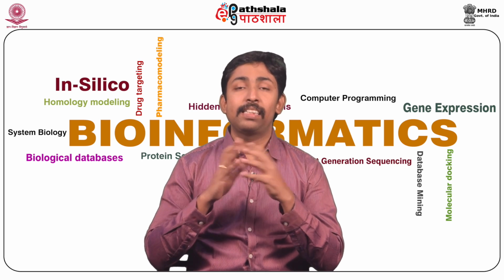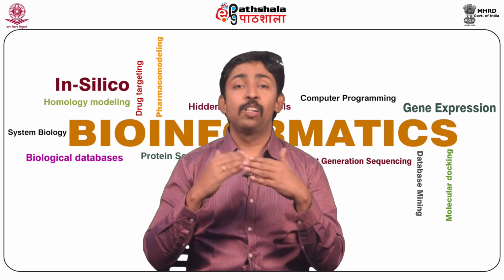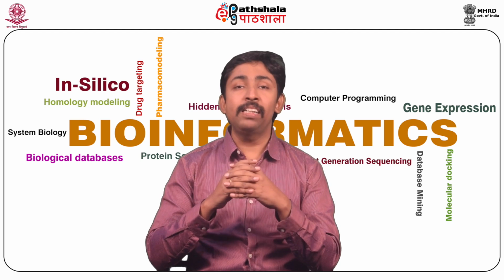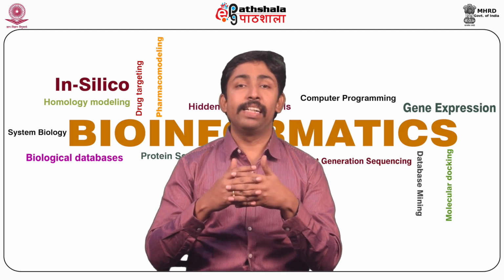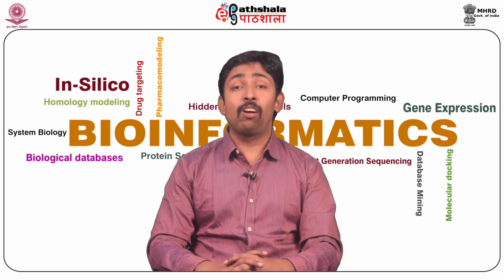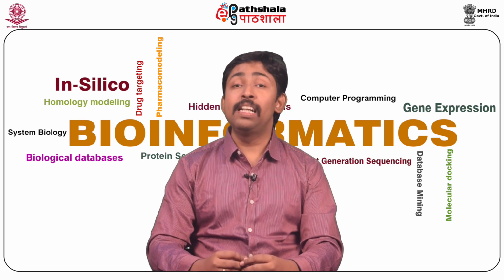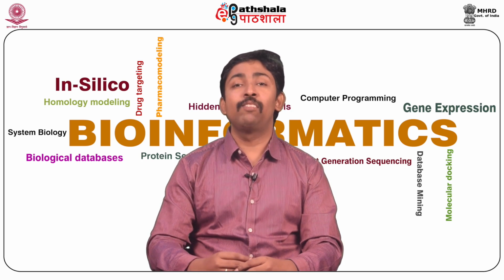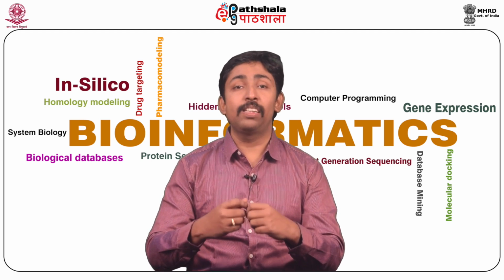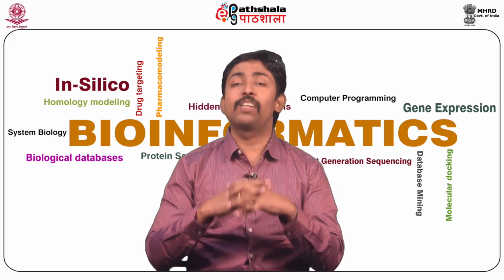Later on, since it creates a sequence record object, any of the main attributes as well as additional attributes can be printed by using appropriate functions. For example, if I want to print the ID alone of the sequence record, all I have to say is print seq_record.id, and I will have the ID. Similarly, if I want to print the sequence, all I have to say is seq_record.seq. We can also use additional functions along with this sequence record object. For example, if I want to know the length of the sequence, which is not data present in the sequence file itself but is derived data, I say print, in the bracket use the len command, and then give the sequence record object.